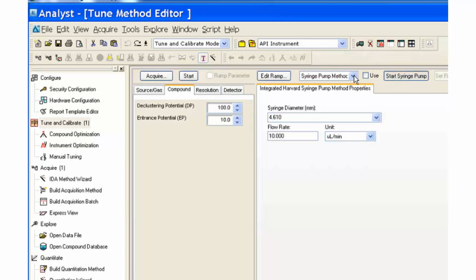Turn on the syringe pump. For more details on starting the syringe, please refer to the hardware guide.